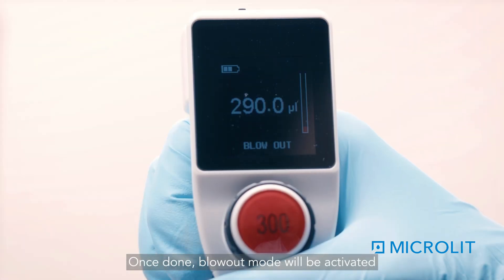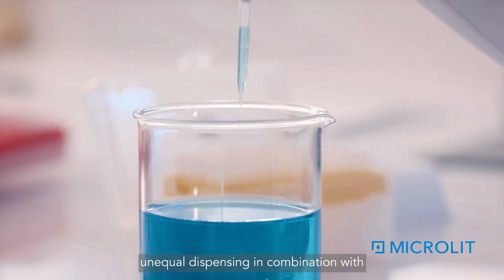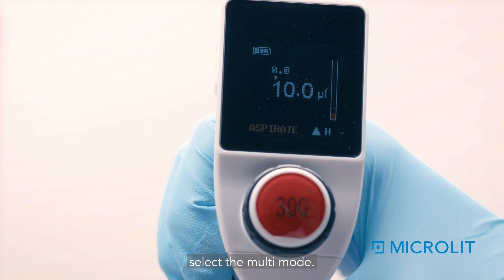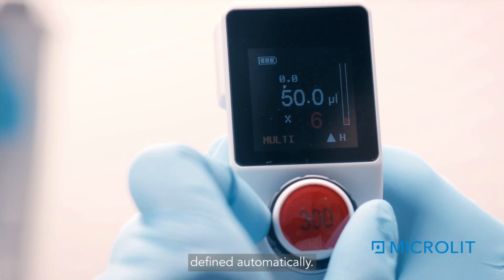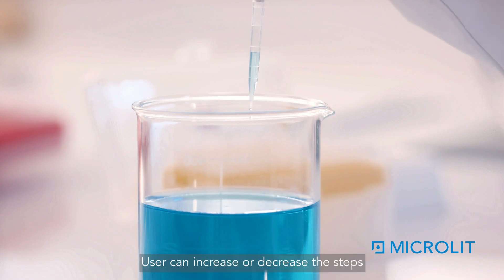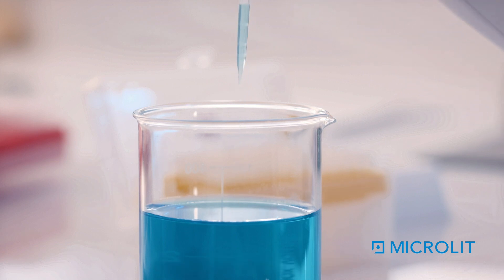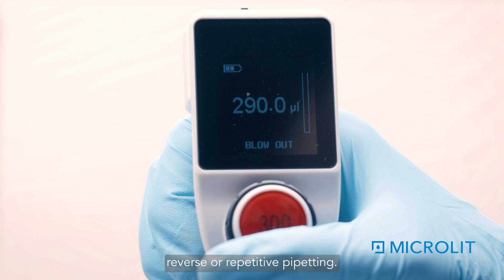Once done, blowout mode will be activated to dispense the residual volume from the tip. Multi-Mode can be used for equal and unequal dispensing in combination with Aspirate and Pipette modes. Press the function button three times to select Multi-Mode. Set the volume using the volume adjustment wheel — steps will be defined automatically. Press the plunger button to aspirate the total volume in one go, then press the plunger button to dispense. The user can increase or decrease the steps as required. Each time the plunger button is pressed, one dispensing step is performed; the display shows the number of dispensing steps remaining. Then press the plunger button again for blowout. This mode can be used for reverse or repetitive pipetting.